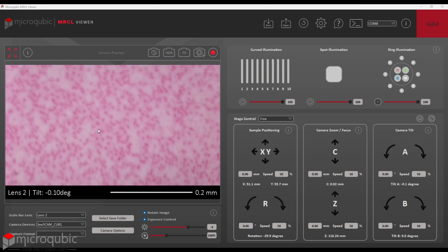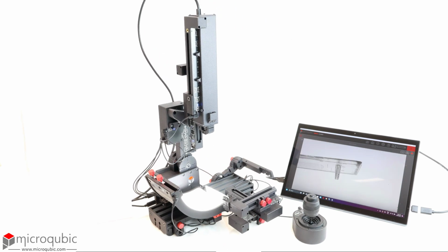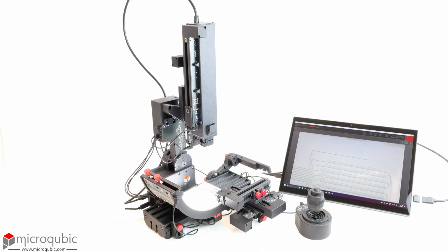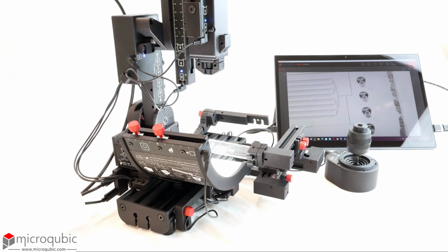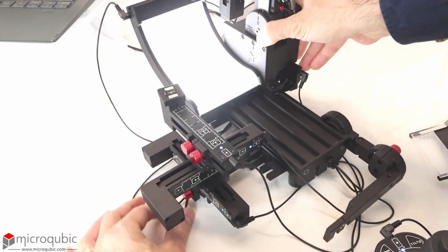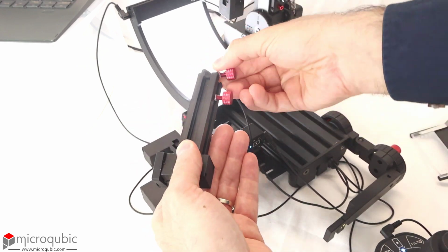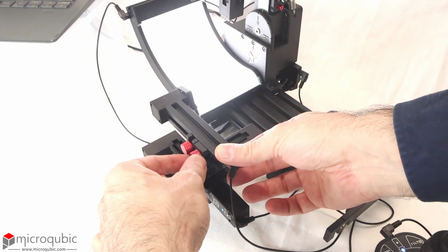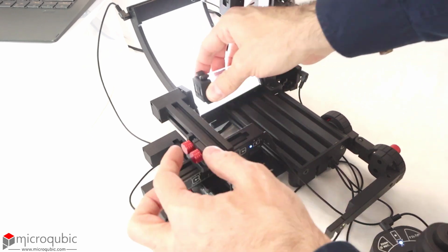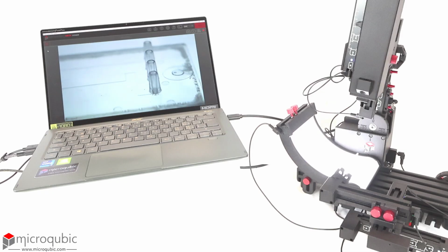So far, we have discussed imaging in transmitted light and reflected light modes using camera tilting. But this microscope has another feature that allows you to tilt the sample instead of the camera to capture 360-degree videos of the sample. First, extend the XY stage by pulling it out from the thumb screw underneath. Then, unscrew the rotary actuator, slide in the screws on the other side, and fix it back 90-degree rotated. Use the provided spring-loaded holder to clamp the sample to the rotary actuator. You can then tilt the sample 360 degrees and adjust its position using the XY stage.